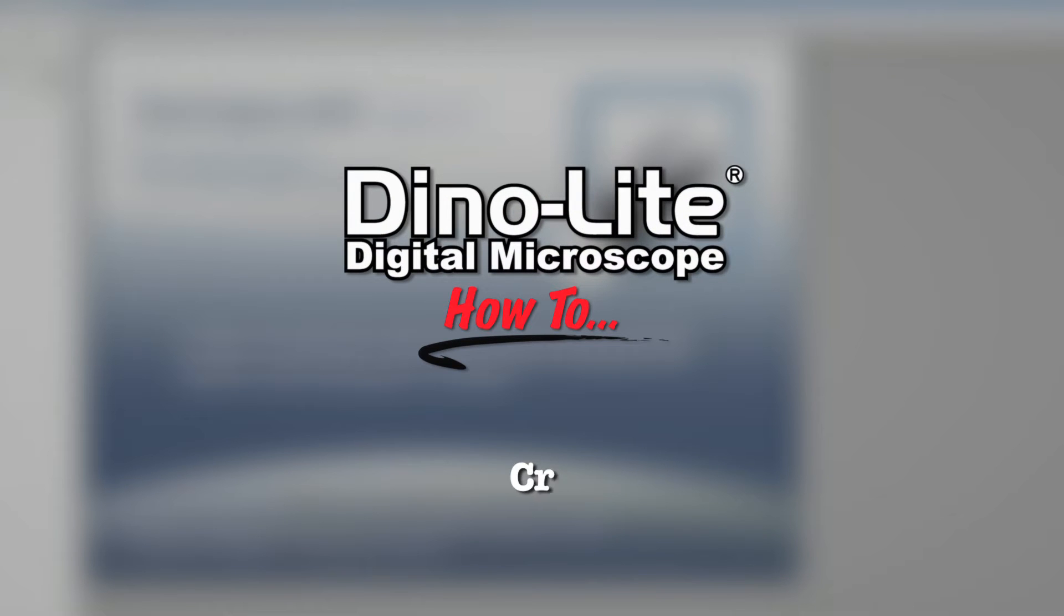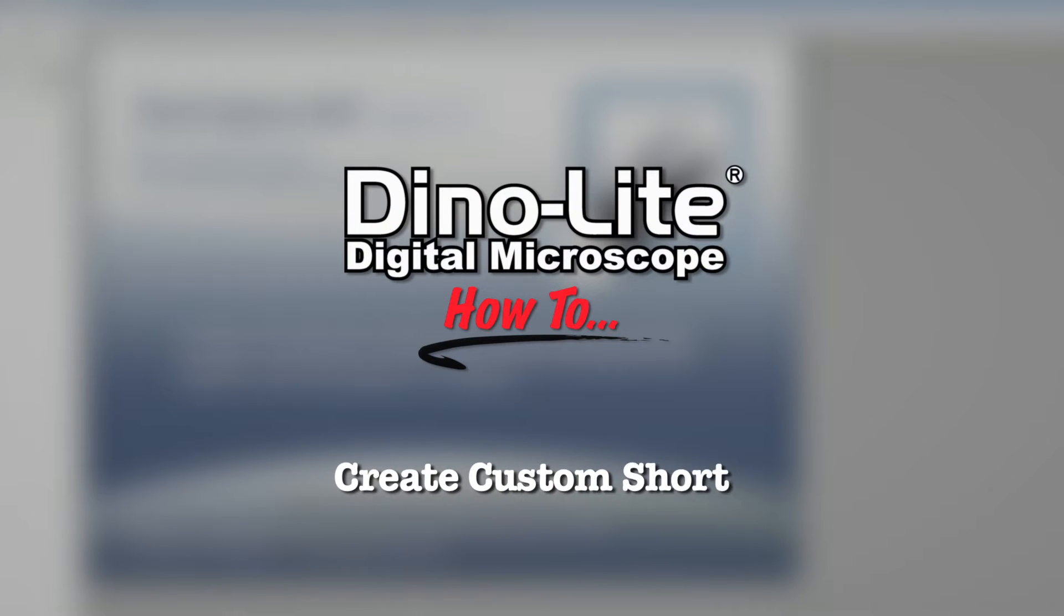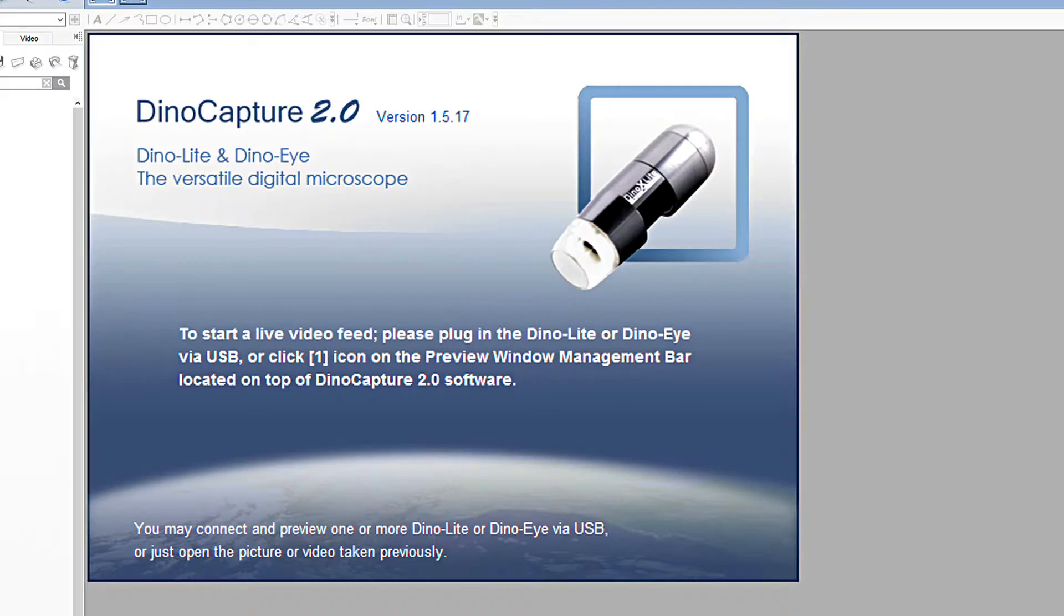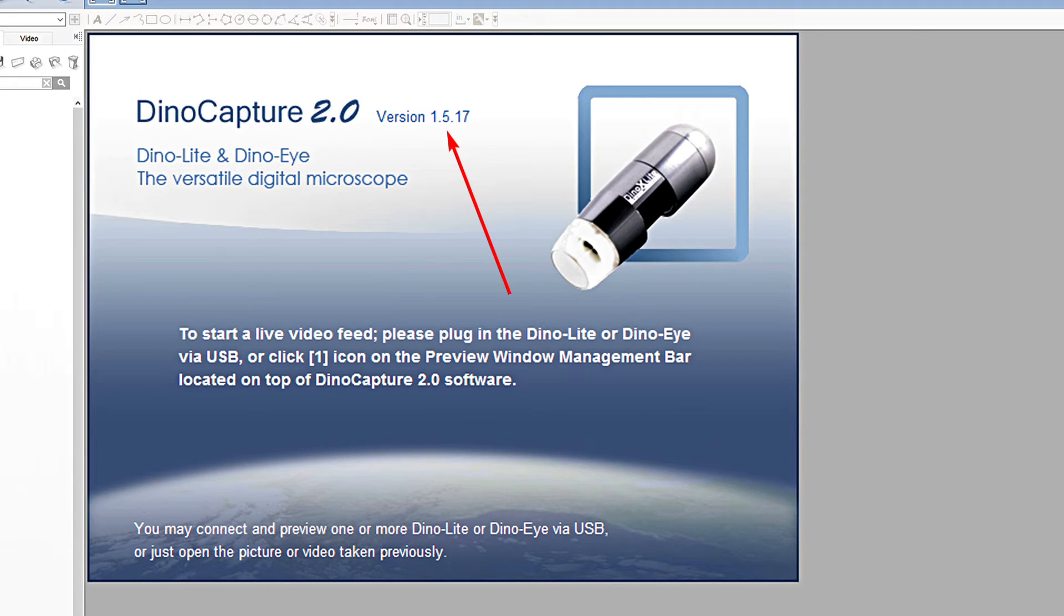In this video, we'll show how to take advantage of the new Customize Shortcut Keys feature for DinoCapture software. This feature is available on versions 1.5.17 or newer.